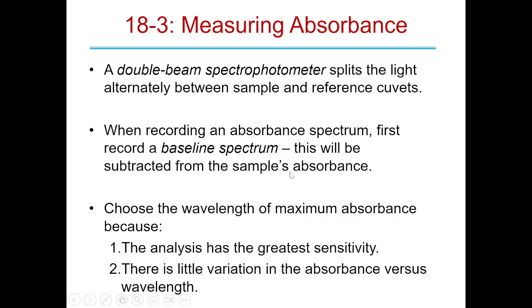Okay. Yeah. So you'll choose the wavelength of the maximum absorbance when you're doing something that can't select wavelengths rapidly. For example, like the UV visible light spectrometers you guys used. Okay? I believe those can actually go slightly into the UV as well. Anyways, so you selected a wavelength, right? Why do you do the wavelength of maximum absorbance?